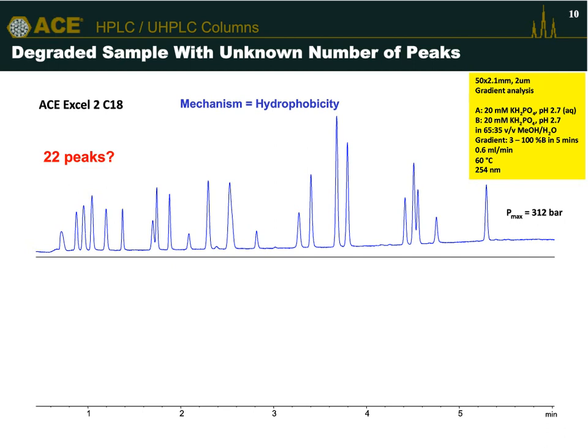Now, there are lots of options for us now to modify this chromatography to see if there are other components in this sample.